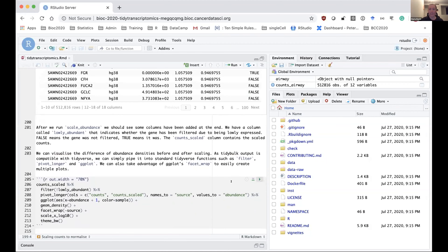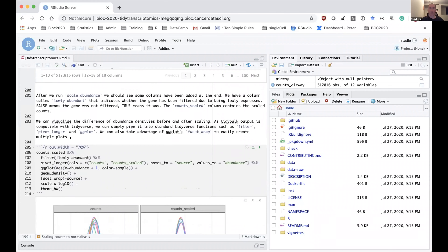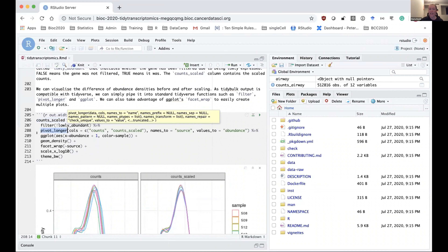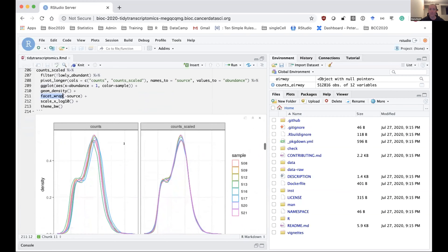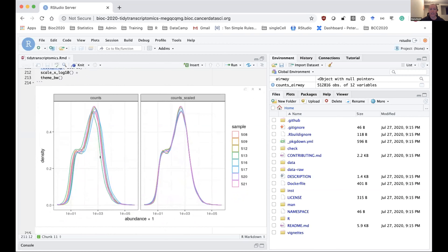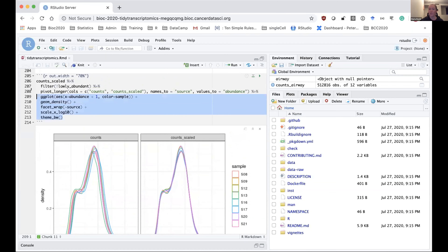Because tidybulk integrates nicely with tidyverse packages, we can take our scaled counts and pipe them into the standard tidyverse filter function to remove lowly expressed genes, and into other tidyverse functions such as pivot_longer to reformat and ggplot to make plots. We can also take advantage of ggplot's handy facet wrapping to easily create multiple plots. Here I'm making density plots of the counts before and after scaling. As you can see, the scaling has helped make the distributions more similar, and it didn't take many lines of code — and it's familiar code if you're used to tidyverse.